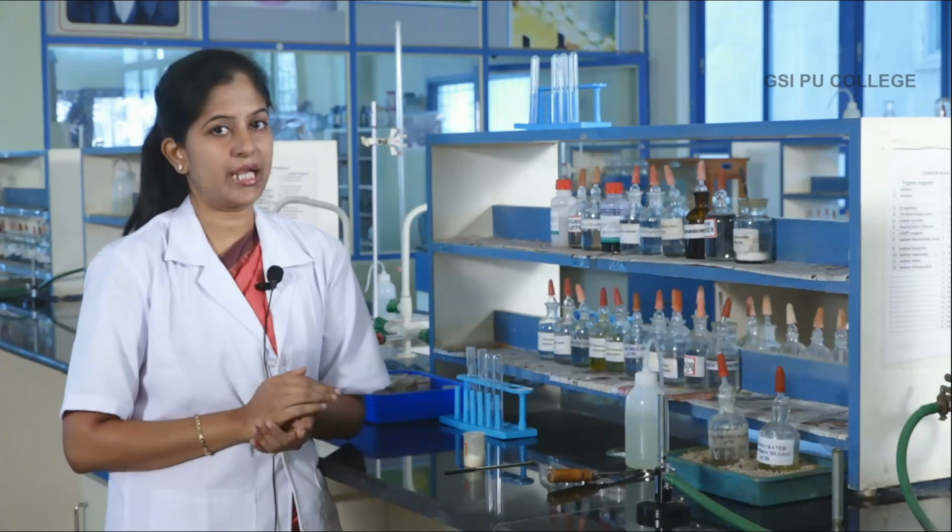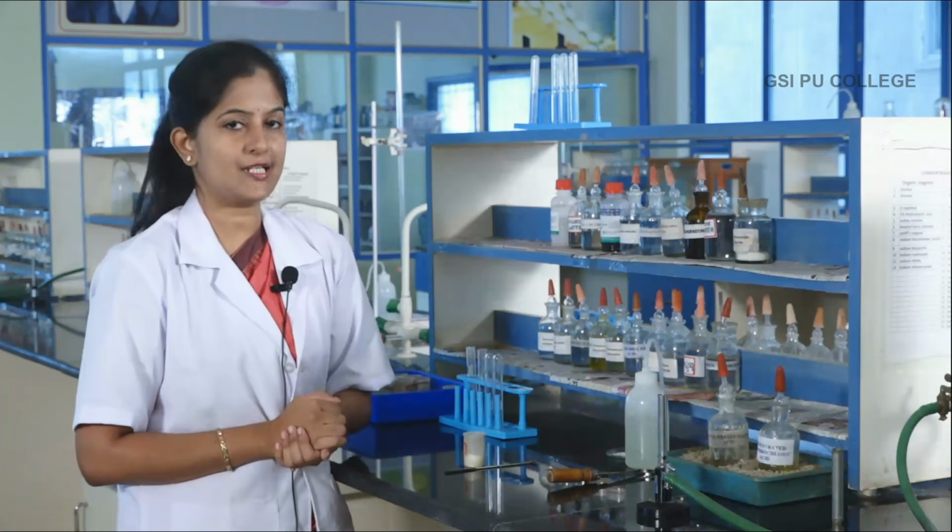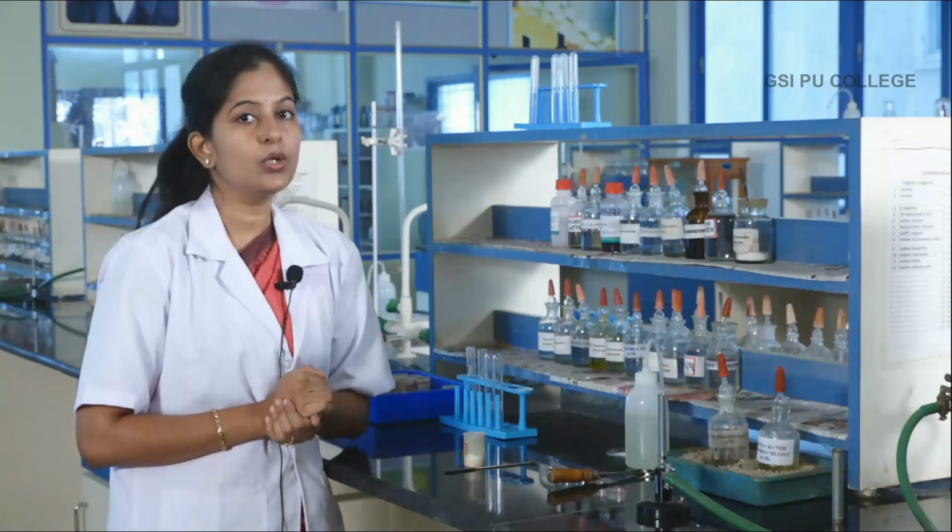So, in the group test we have found out that the given salt has an acid radical in second group and that is nitrate. So, now we have to perform the confirmatory test for nitrate. The confirmatory test for nitrate is the brown ring test. So, what is the procedure to perform the brown ring test?